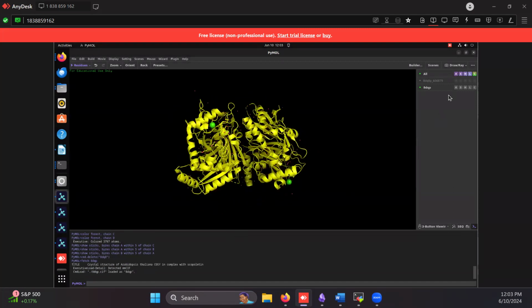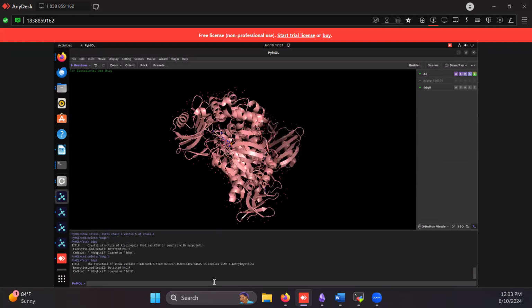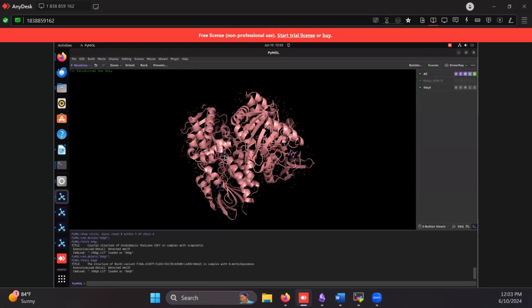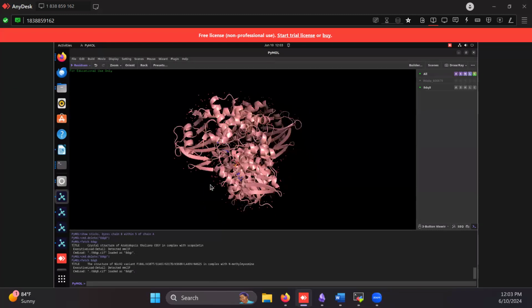Oh, I think it's maybe the wrong one. Oops. Oh, there you go. And let's see if we can visualize the ligand much better.